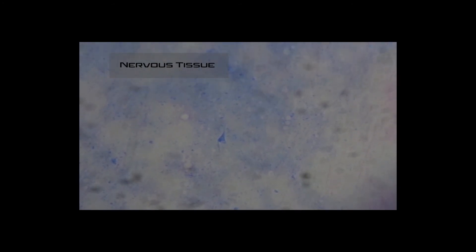So the next slide we're going to look at is the nervous tissue. And there's really only two major types of cells in nervous tissue. There's neurons and neuroglial cells. So zooming into the highest magnification, we could see one of these very large neurons. And this is what's going to pass action potentials for communication inside your body. And around the neuron, you'll see all these little tiny cells. And these are neuroglial cells.